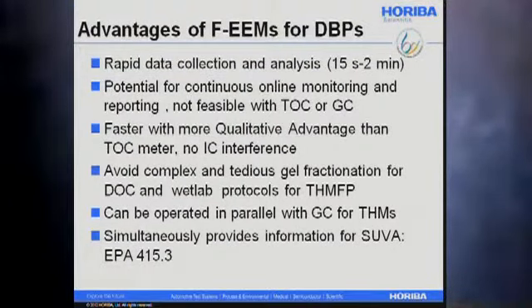So some of the advantages of this, again, is it's very rapid. It has the potential for continuous online monitoring. Again, there are a number of advantages in comparison with the total organic carbon meter and gas chromatograph, in that it's actually a truly online capability. And the advantage is that the fluorescent compounds that you're measuring are the most highly correlated compounds with the disinfection byproducts.